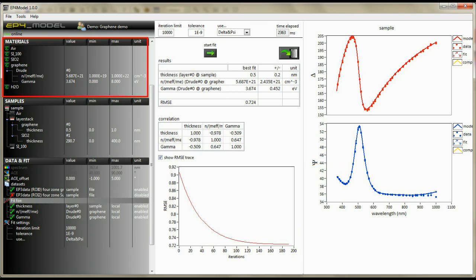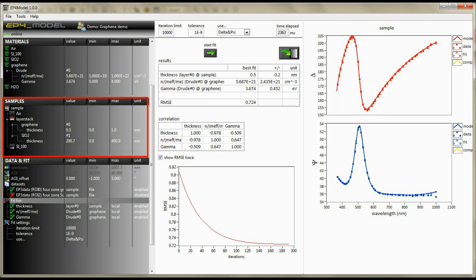The material definition section to define all materials present in your sample. The sample definition section to arrange those materials in the right order. And the parameter definition section for fit and simulation.